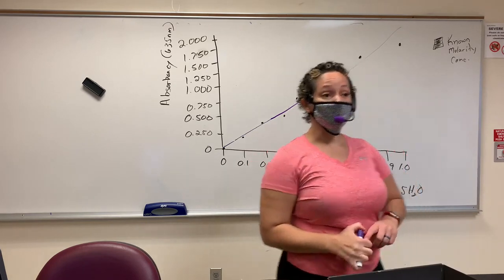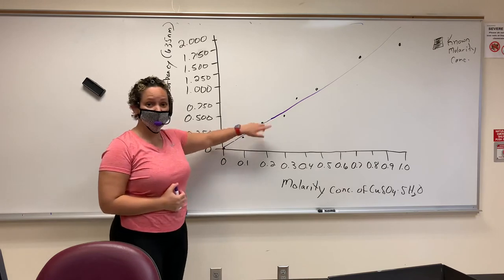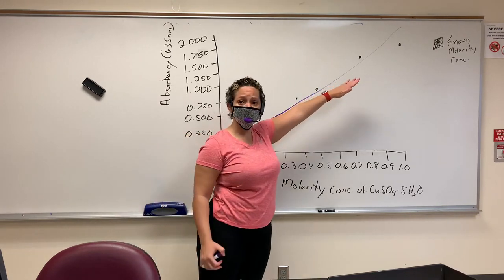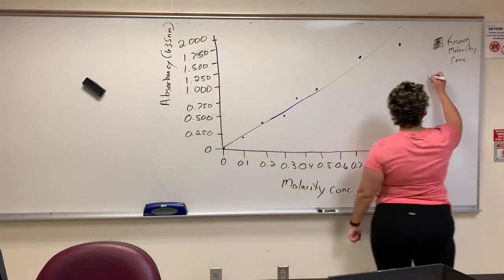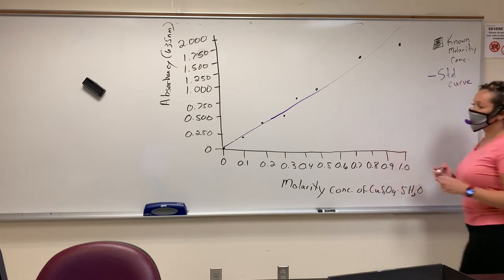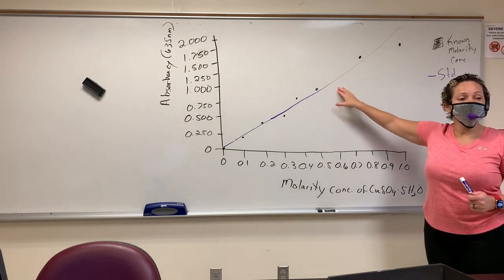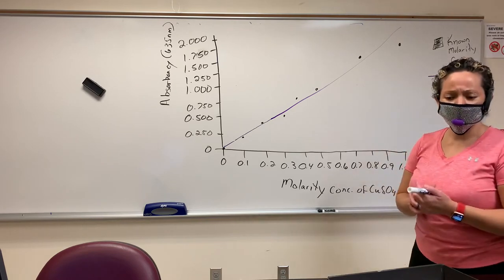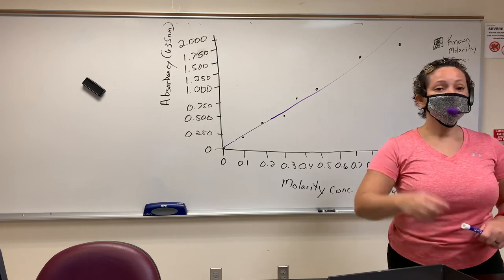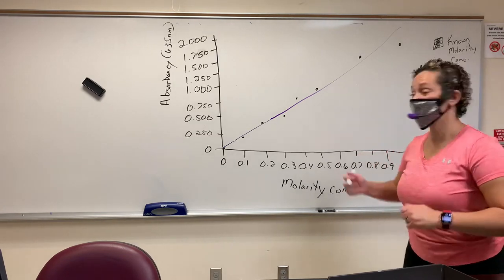Made a standard curve is what I did. So I used known data points that I got the data for to establish a standard curve. You could even put that on here. STD curve. And what the standard curve is, this is a tool that can be used to predict other values. So we had 3 unknowns, right? Yeah, we had 3 unknowns.